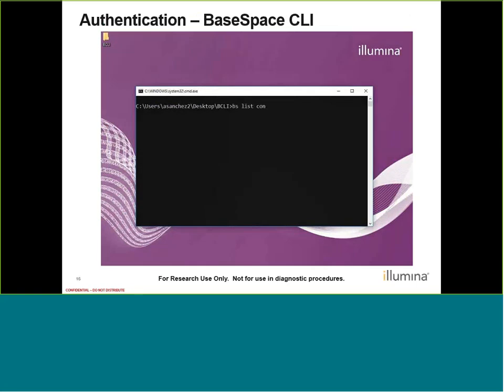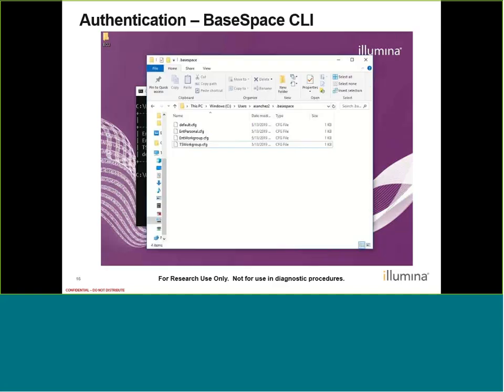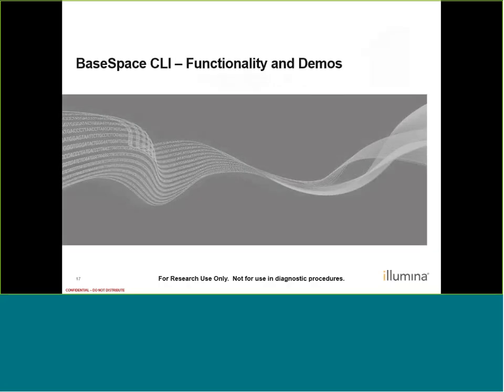For those that have several configs at the same time, we can type the command 'BS list config' and it shows all of the config files that I just authenticated in the previous demos. The default is going to be my personal space on the public domain, but I also have all these other workgroups that I authenticated. These config files are in my home directory in a hidden directory called '.basespace', and they just contain the access tokens — basically the authentication we just performed in order to access our accounts.